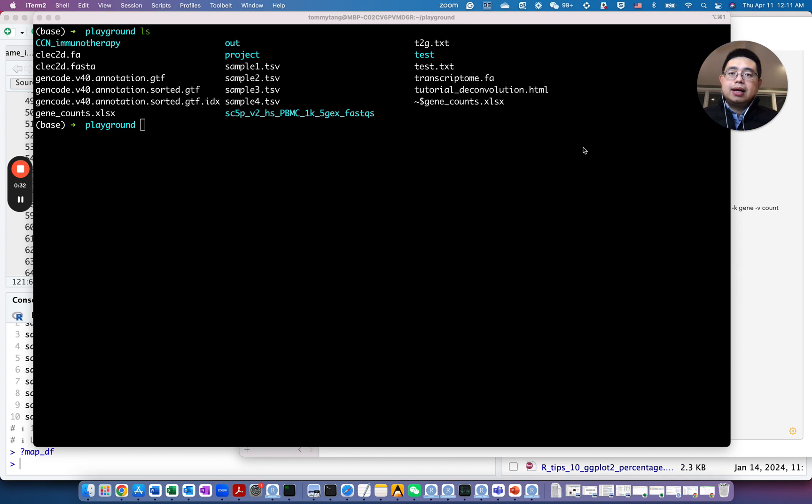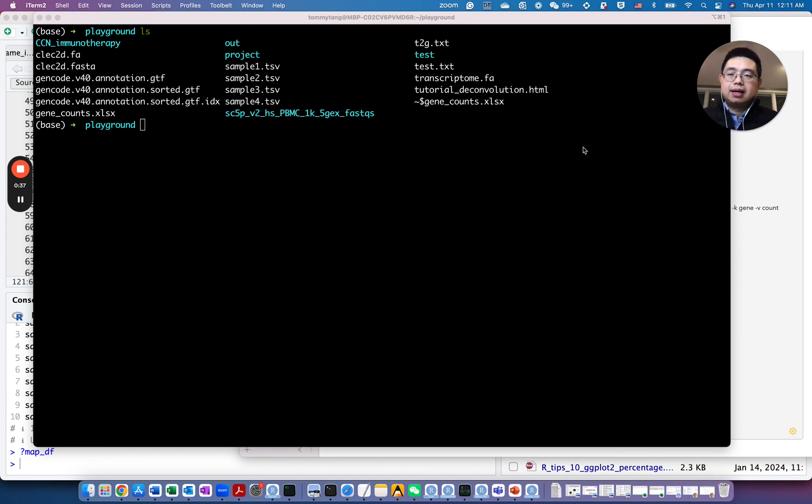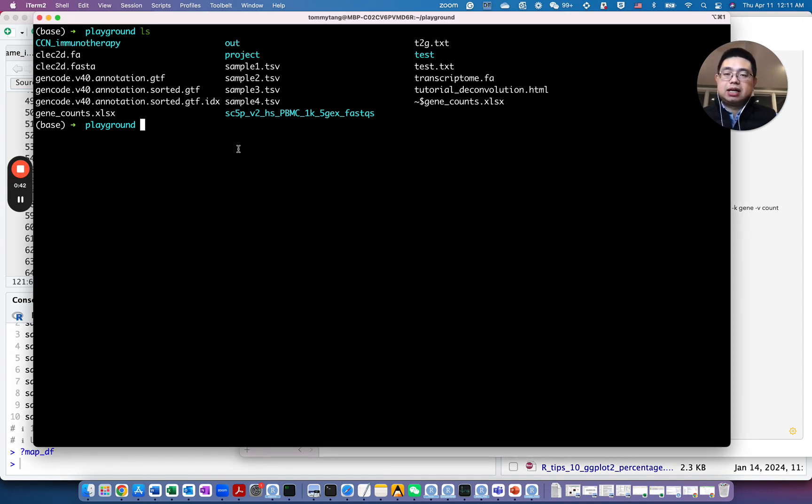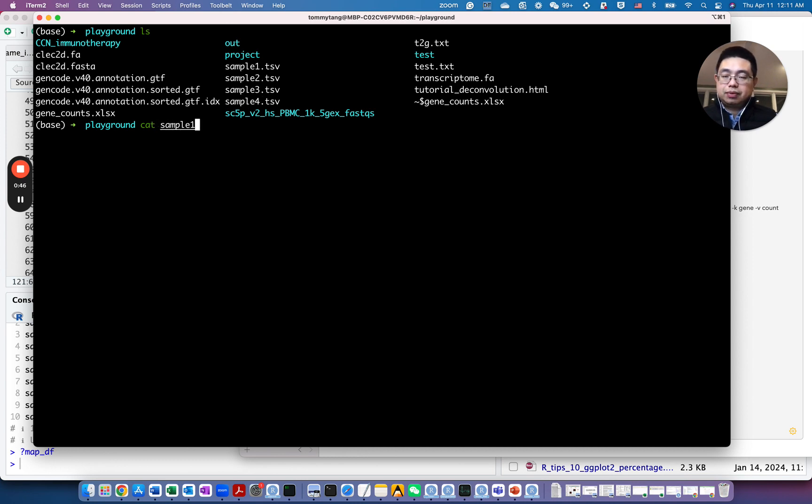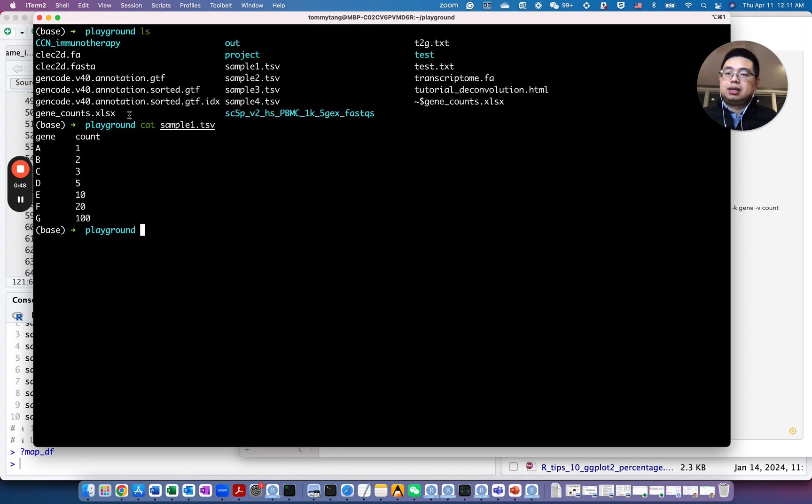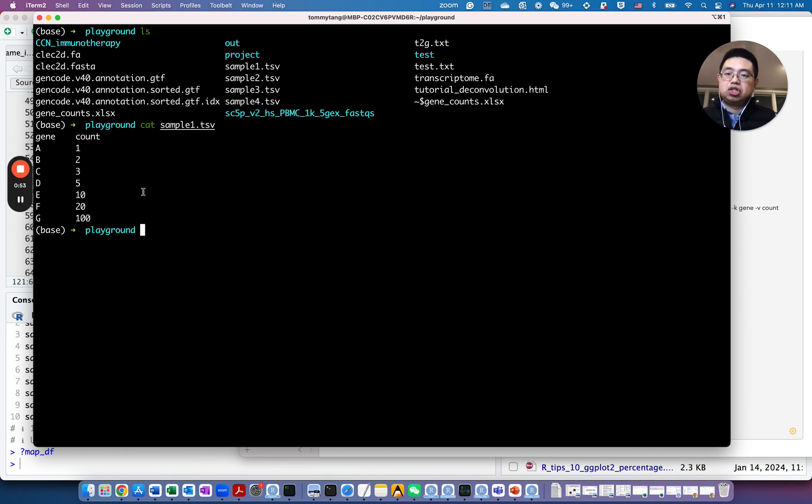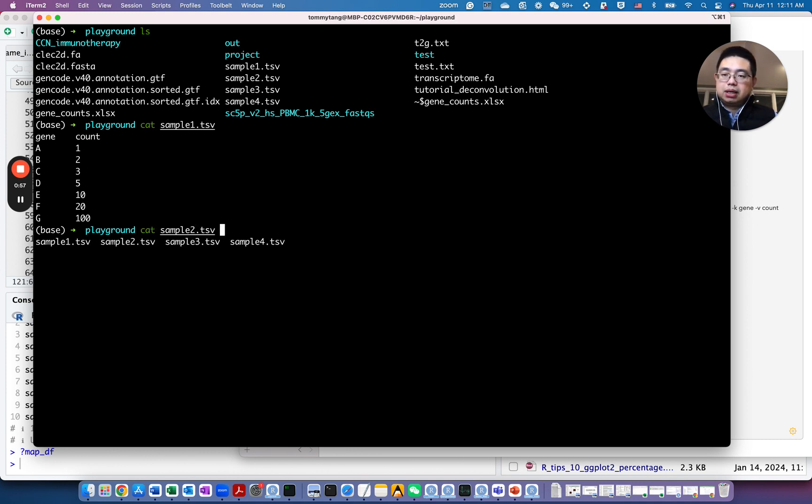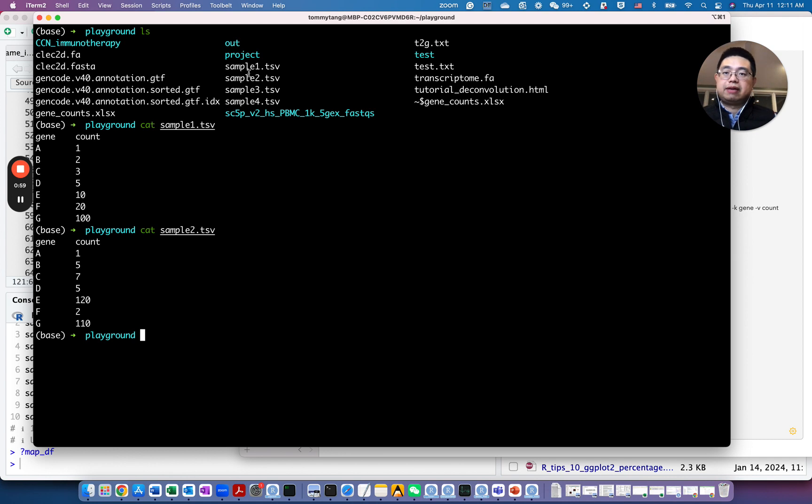So Unix commands are still one of my favorite tools to wrangle data in terminal. In this case, let's take a look at the dummy data that we have. So sample 1, 2, 3, 4.tsv here. So you see each file has two columns, gene column ABCDEFG, and the count column for that gene. If you look at sample 2, it's the same thing. So we have four samples here.